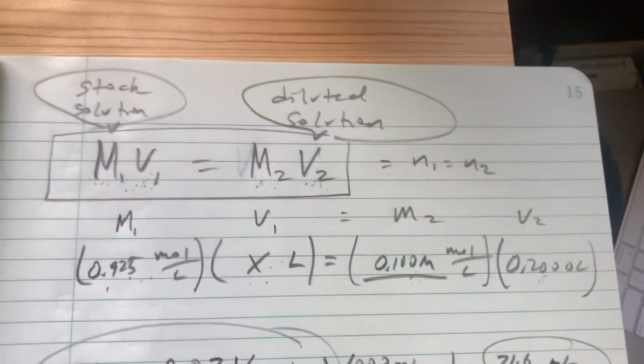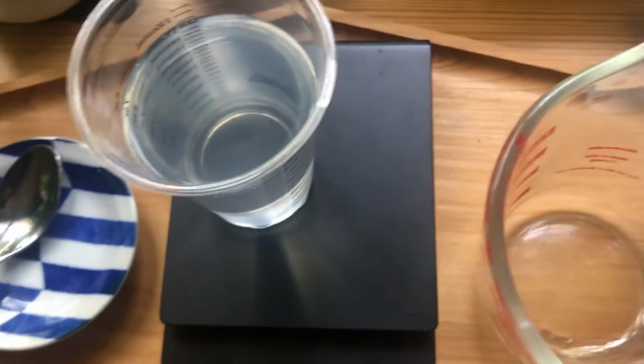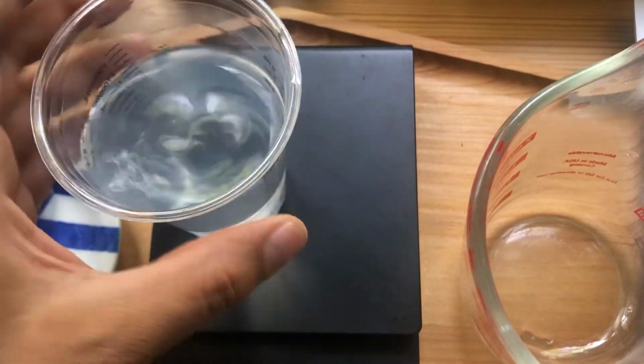Okay, so let's do that right now. Let's make it and then talk the math. Okay, so here is my stock solution. I'm going to pour it in here because this is my more accurate thing.